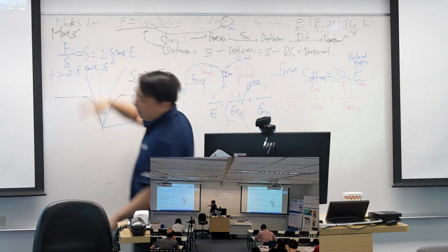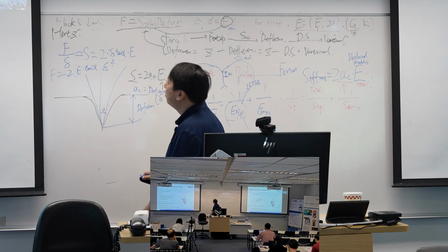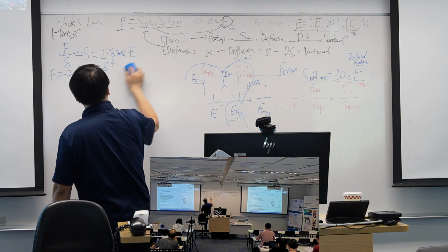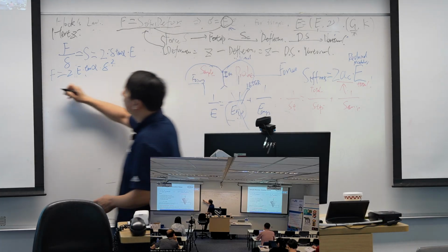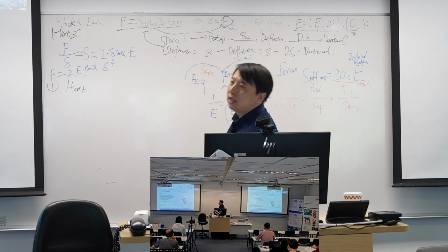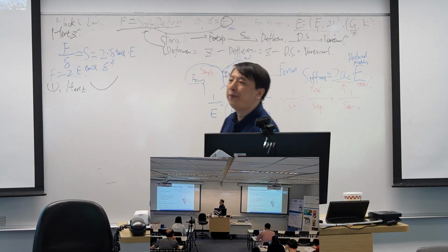That's his job. Okay. Then from that, people finally established this kind of solution. So they think about it this way. In the Hertz model, my indenter or my stylus is a sphere.